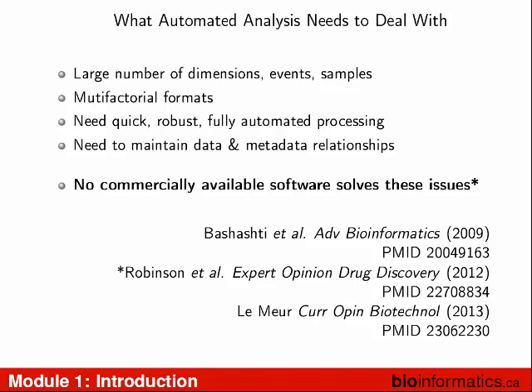And I have to say for our group, time and time and time again, when we're analyzing data sets from different studies, and even studies that we're intimately involved with, it's the metadata, the data about the FCS files, that has been absolutely, positively, without a doubt, the most difficult thing. It's not the analysis. If all the data comes in, and we understand what it is, and all the FCS files are properly annotated, it goes kind of well.